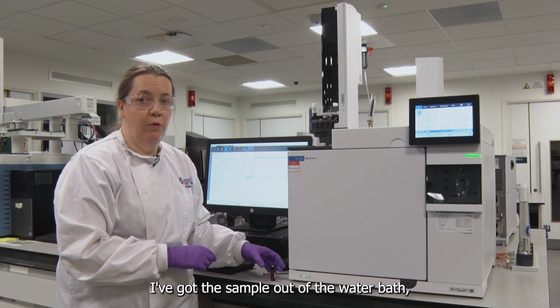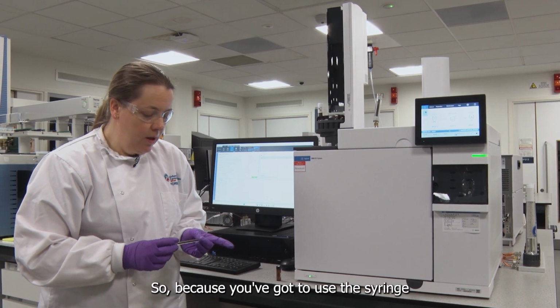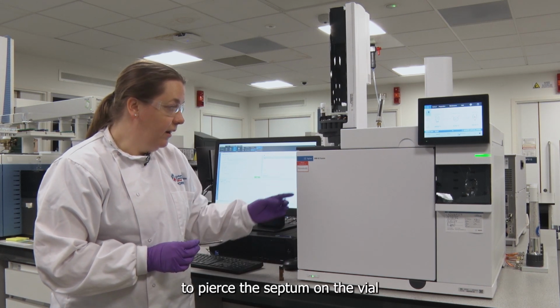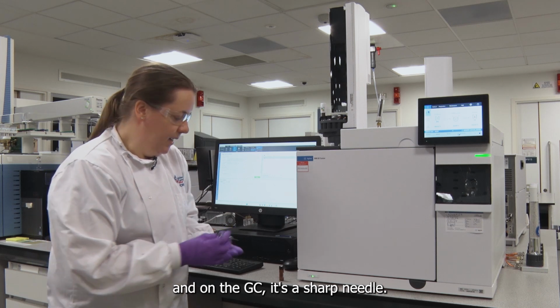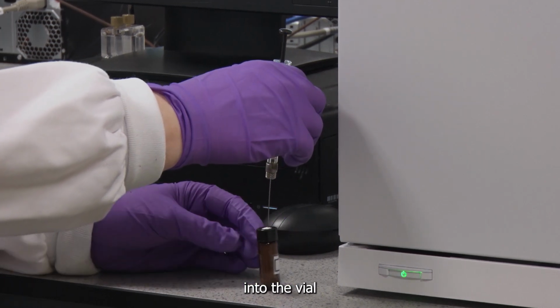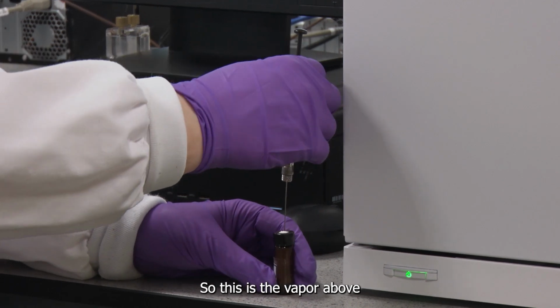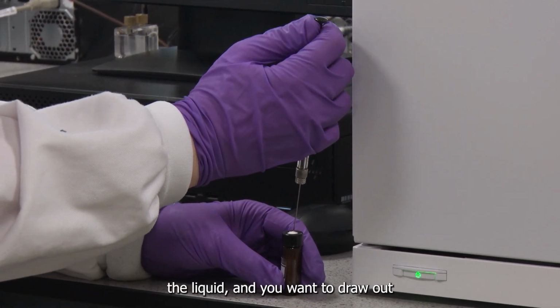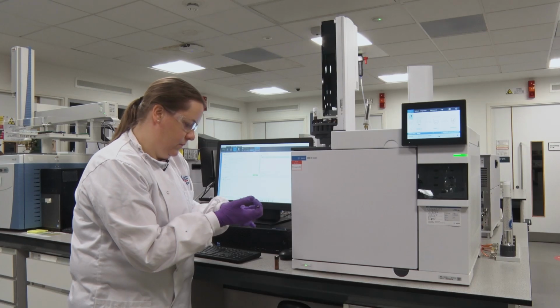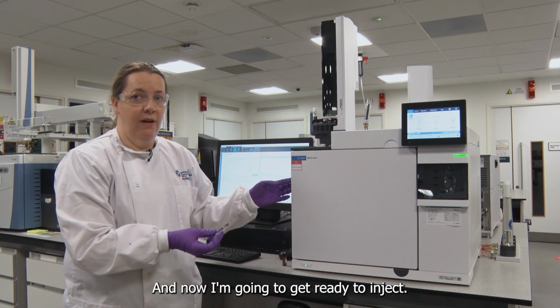I've got the sample out of the water bath and you may find it's a bit hot, so I'm going to get the syringe. Because you've got to use the syringe to pierce the septum on the vial and on the GC, it's a sharp needle. So you inject into the vial and you want to take only the headspace, so this is the vapour above the liquid, and you want to draw out 200 microlitres. So I've got 200 microlitres. And now I'm going to get ready to inject.